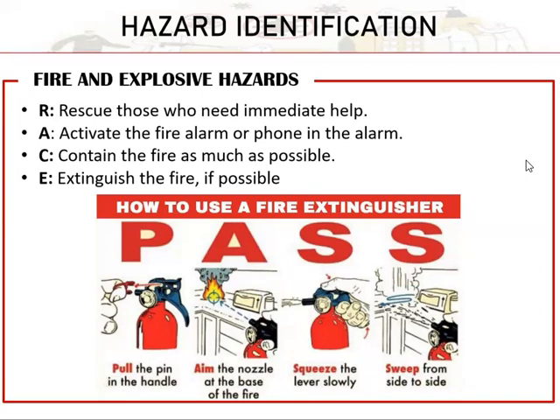And then letter C, contain the fire as much as possible. And letter E, extinguish the fire if possible. Now, in the hospitals class, always yun na siya na fire drill, kay para ma-remind all the time ang mga hospitals on what to do in cases of fire.